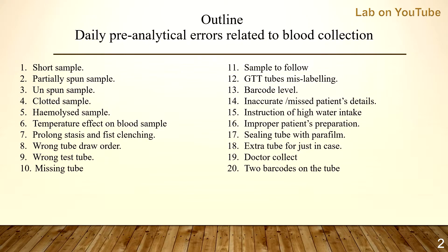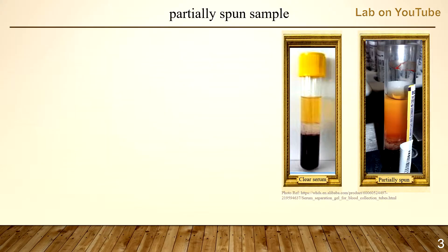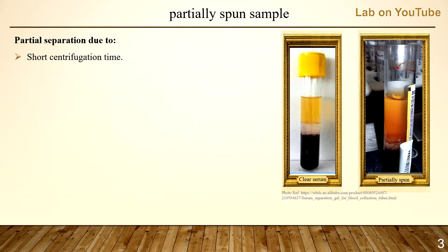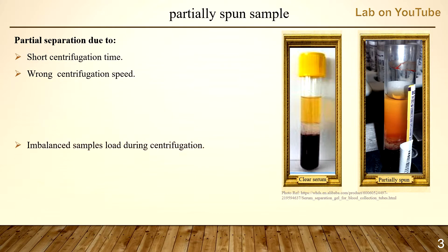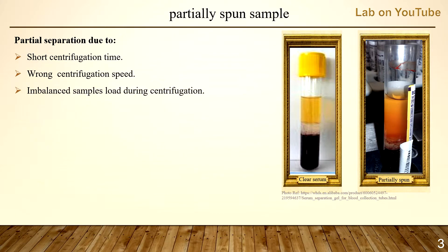Let's move on and talk about the second pre-analytical error in our list: partial spin sample. Partial spin sample can be due to short centrifugation time, wrong centrifugation speed, imbalance in sample load during centrifugation, or centrifuge mechanical error.